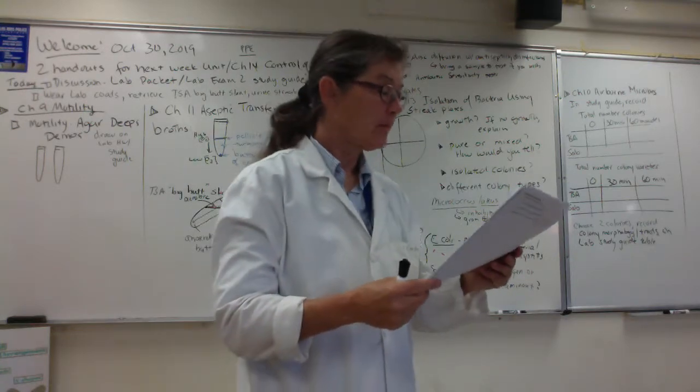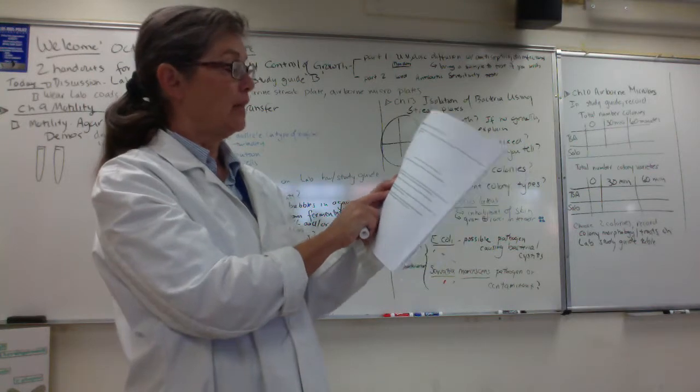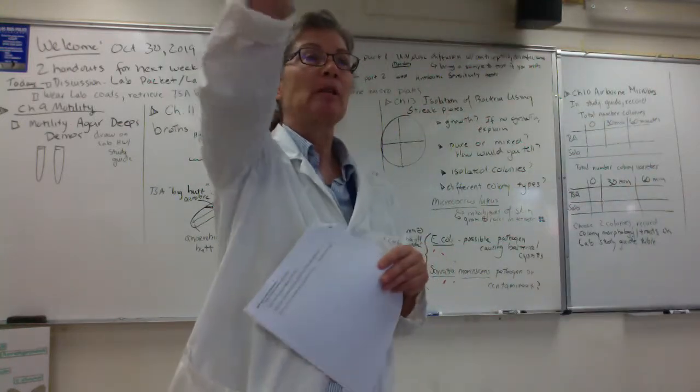Okay. And folks, we already did 4, what might cause a failure of transfer. And then number 5, by just looking at a broth culture, can we determine if it's become contaminated? Nope.